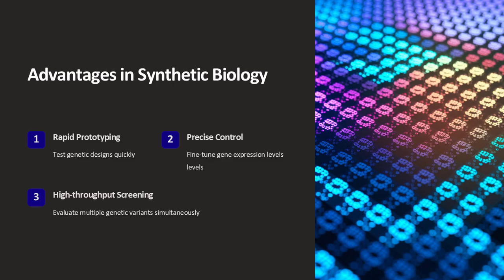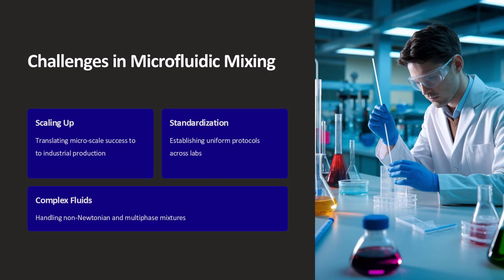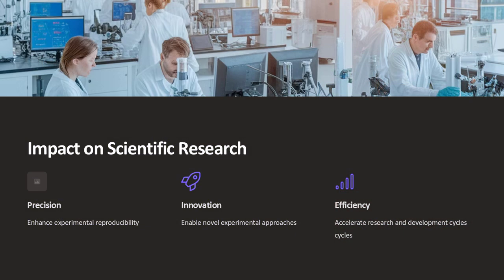or cell lysis. In summary, microfluidic mixing techniques for precise reaction control are revolutionizing the way chemical and biological reactions are conducted. Through a combination of advanced channel geometries, both passive and active mixing strategies, and real-time monitoring, these systems offer unparalleled control over reaction conditions at the microscale.